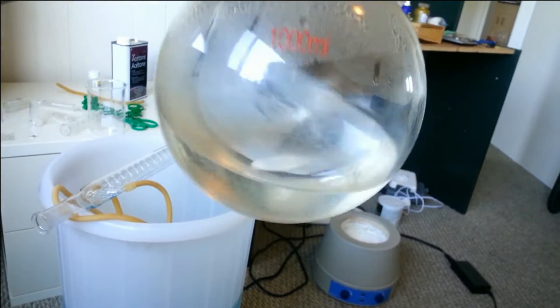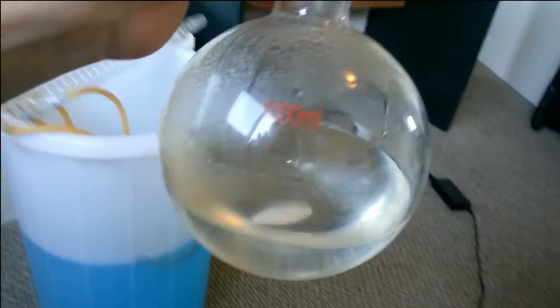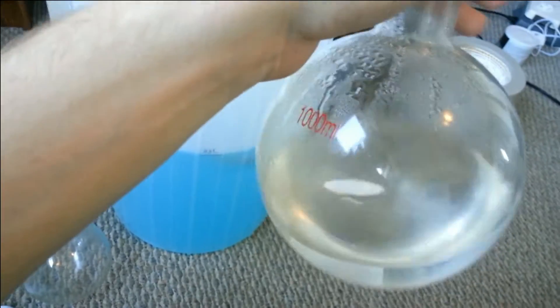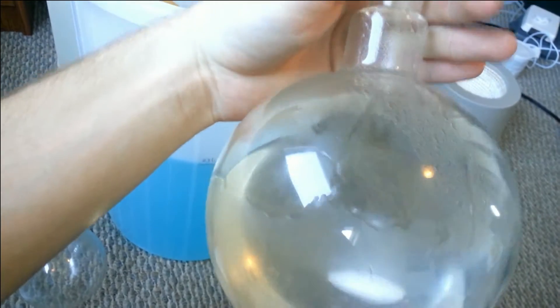Simple distillation is used to separate a liquid from a solid that is dissolved in the liquid. For example, if I wanted to separate water from salt in a solution of salt water, I would set up simple distillation.